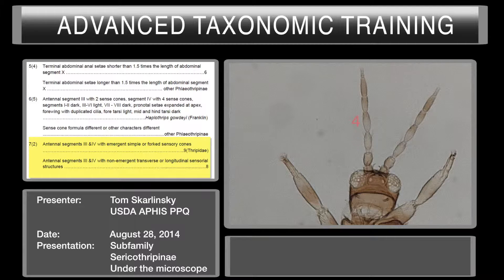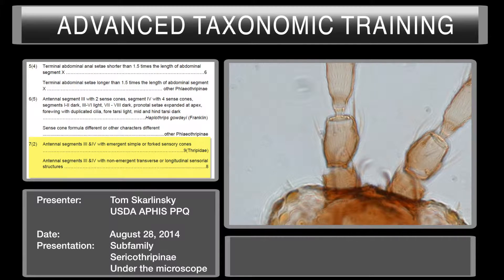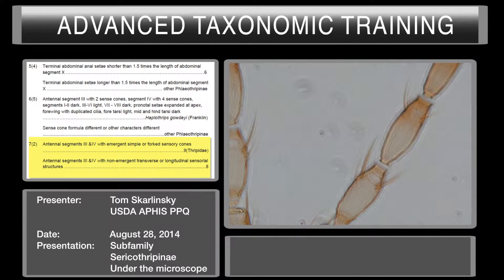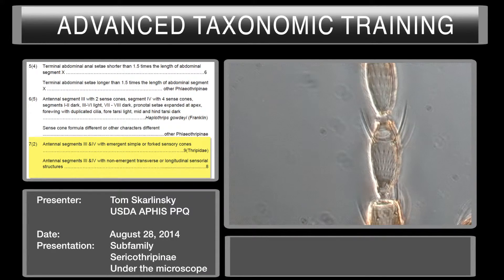What we want is segment three and segment four. We've got segment one, two, and let's try to work our way north a little bit. Now we're at 400 times magnification, and we have an emergent sense cone. In other words, it's not part of the antenna segment — it's not a longitudinal or transverse structure on the antenna segment. It's actually coming out, and like I always say, it looks like a bull's horn, basically attached at the bottom of that U. The tip starts right up here and works down to the base. So we have a forked sense cone.